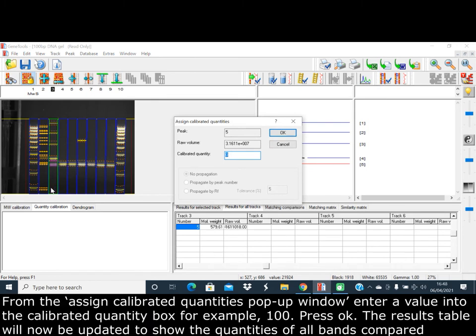From the Assign Calibrated Quantities pop-up window, enter a value into the calibrated quantity box, for example 100, and press OK.